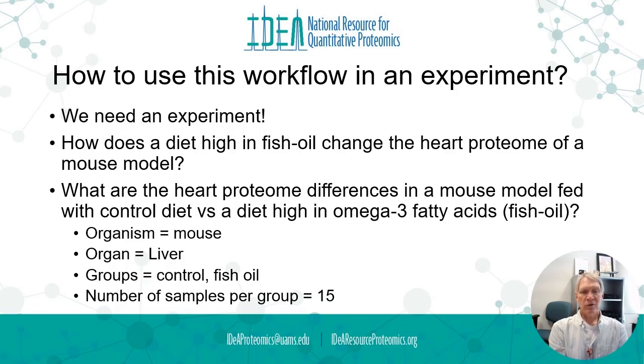So what about: how does a diet high in fish oil change the heart proteome of a mouse model? Or another way to ask that question would be, what are the heart proteome differences in a mouse model fed with a control diet versus a diet high in omega-3 fatty acids, which is basically fish oil? So we've identified an organism. We're going to use a mouse.